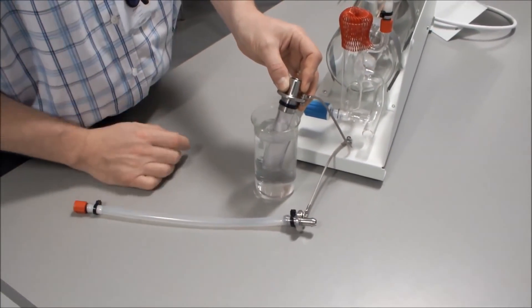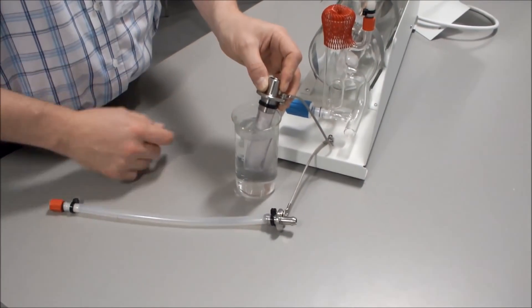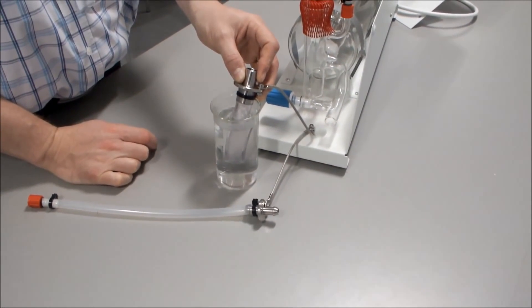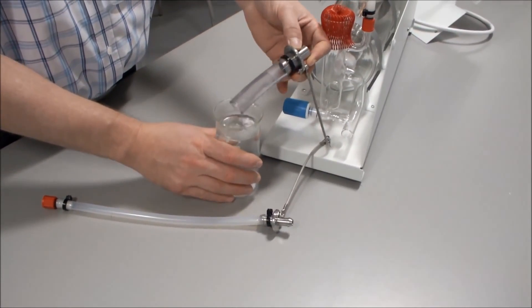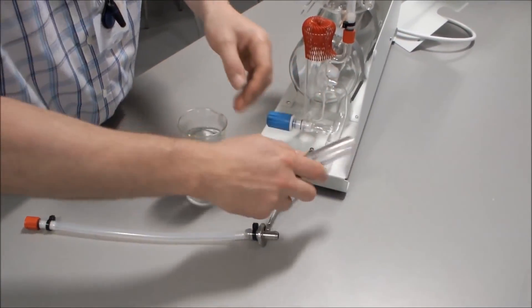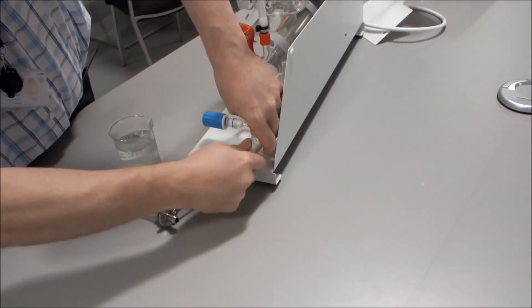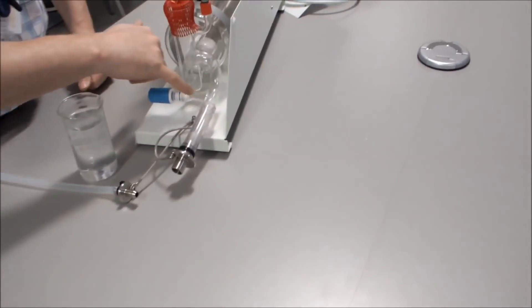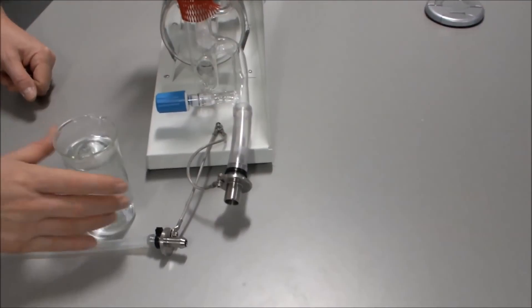To connect the 16mm hose, first put it into hot water for about 20 to 30 seconds to make the tubing supple. Take it out and connect it onto our drain. When it is on fully, you can use the tie wrap provided to secure it.